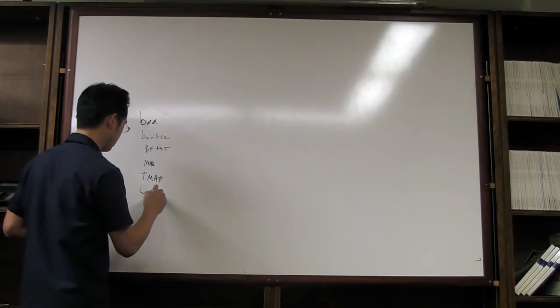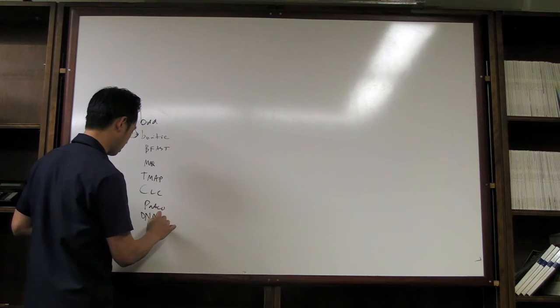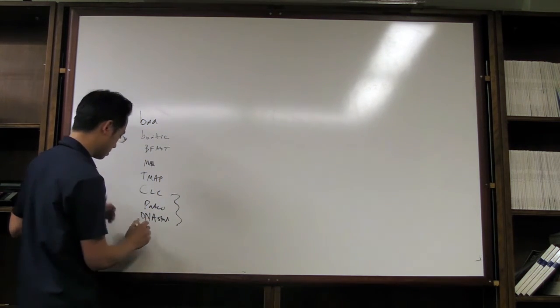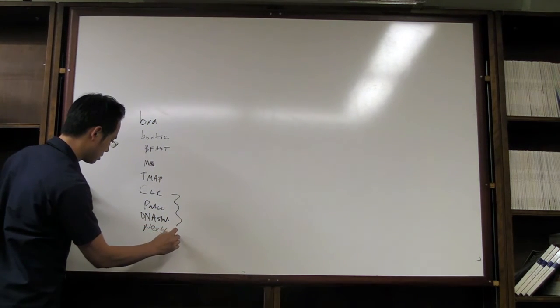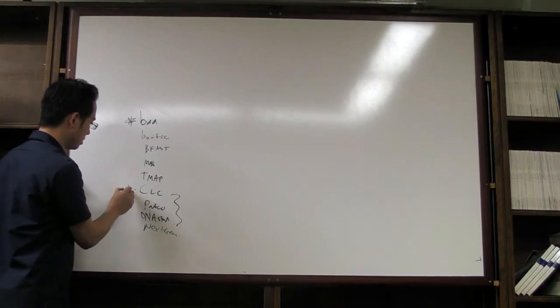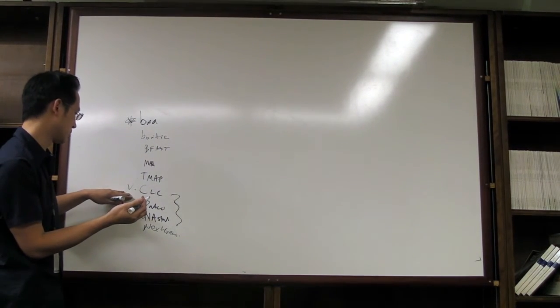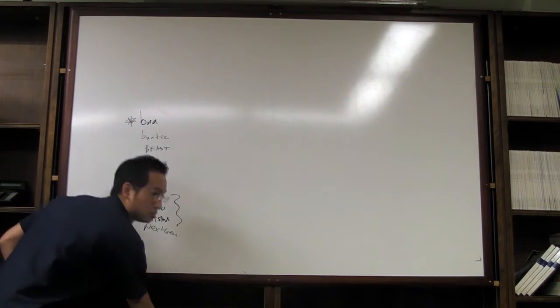tons. CLC Bio, Partek, DNA Star has part of their own proprietary. These are the commercial solutions, by the way. SoftGenetics NextGene, Mini, right? So this is the most popular open source one, and I've used CLC. I have it because it's free, and we got it as part of the prize, so I use it extensively. NextGene I like as well.